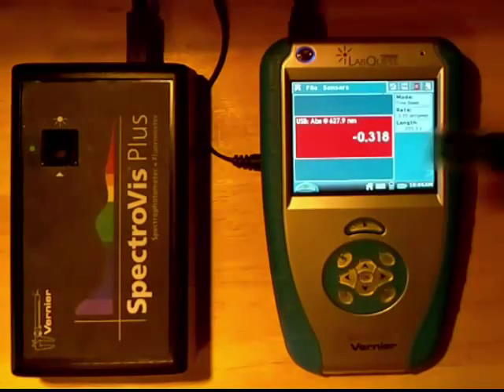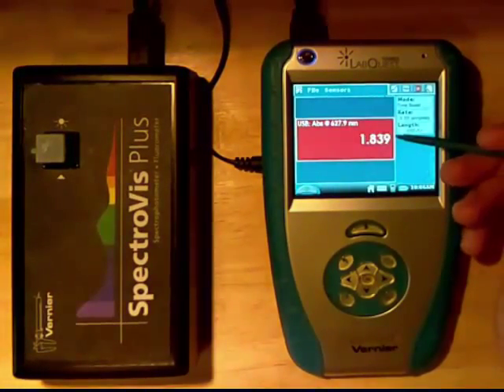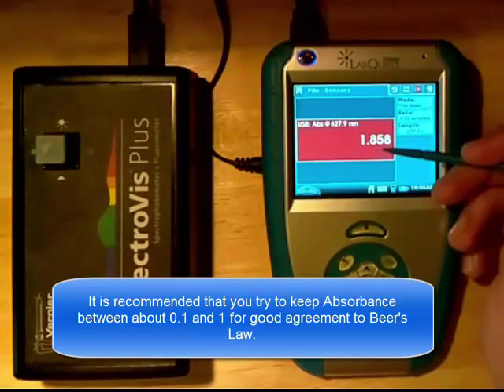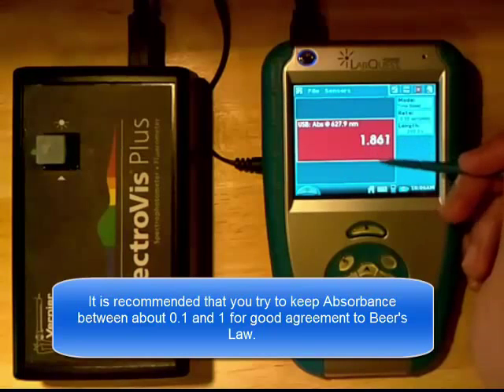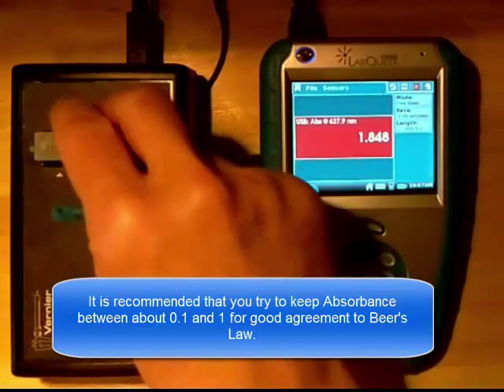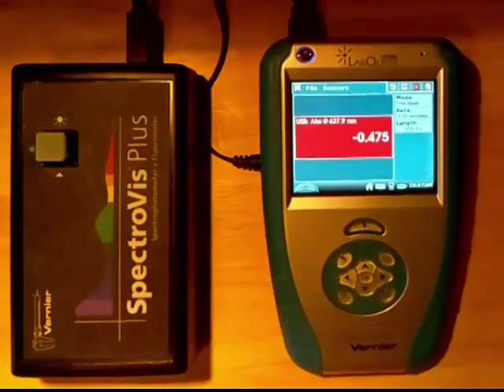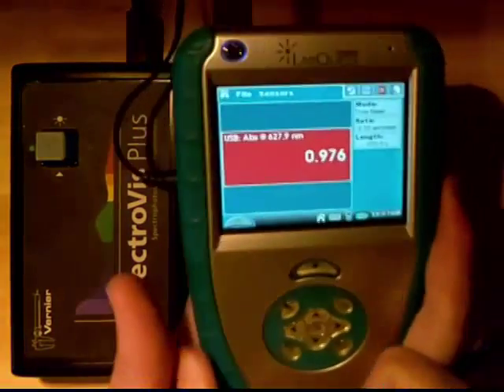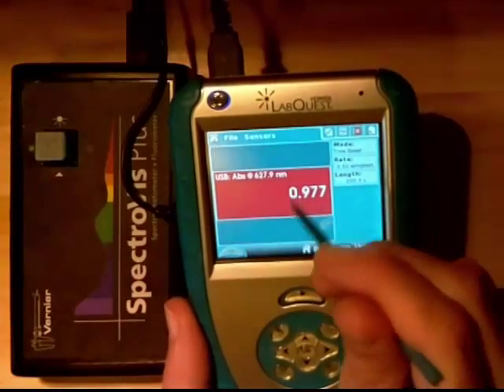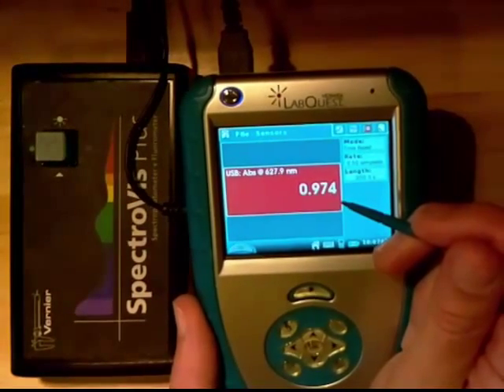Now I could take a higher concentration solution, and I would expect that solution to have a larger absorbance — and yes it does. Notice how this value of 1.8 is very high and is most likely outside of the linear region for a Beer-Lambert plot. Typically we want to keep our absorbance values below 1. So this color was pretty much at the limit. Notice how I never even had to press start or stop — this is just a dynamic screen displaying the absorbance at a particular wavelength, which you can jot down in your laboratory notebook.